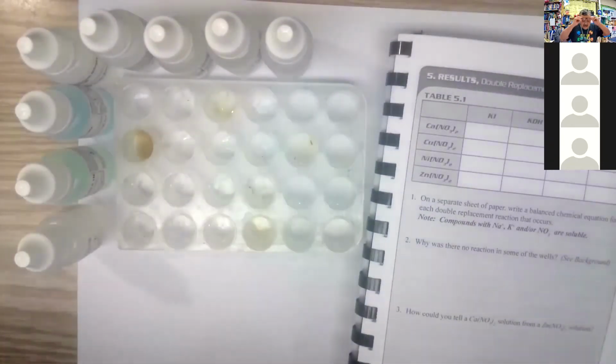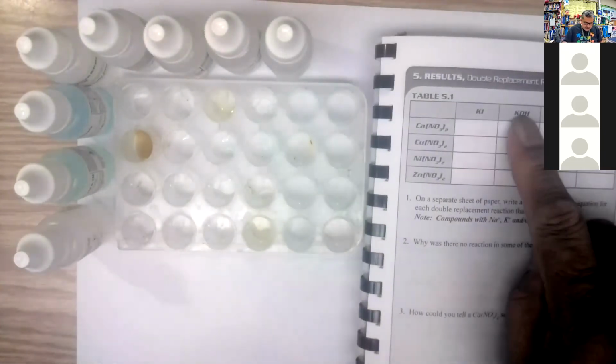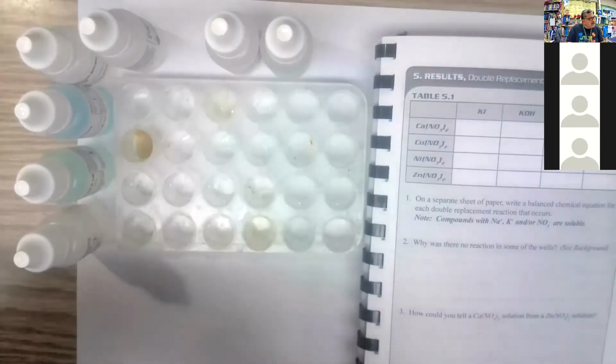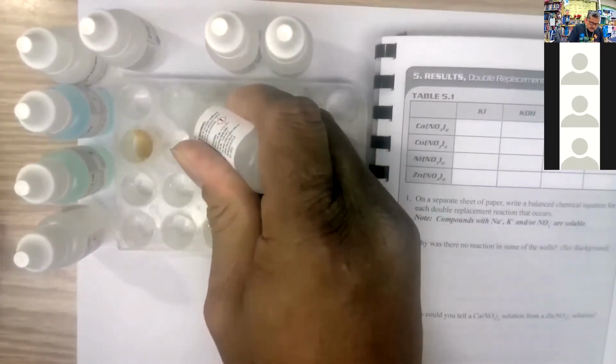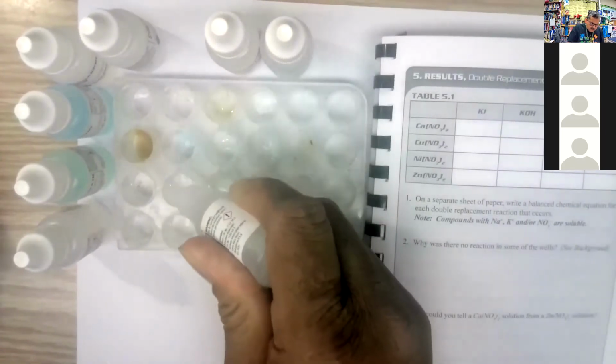Back and do the second one. The second row or second column is the potassium hydroxide. Shake that up a little bit. I'm going to go in the second column at 3 drops. 1, 2, 3. 1, 2, 3. 1, 2, 3.